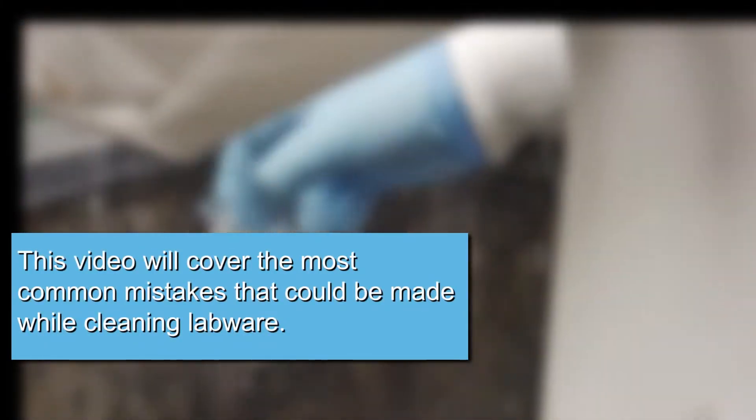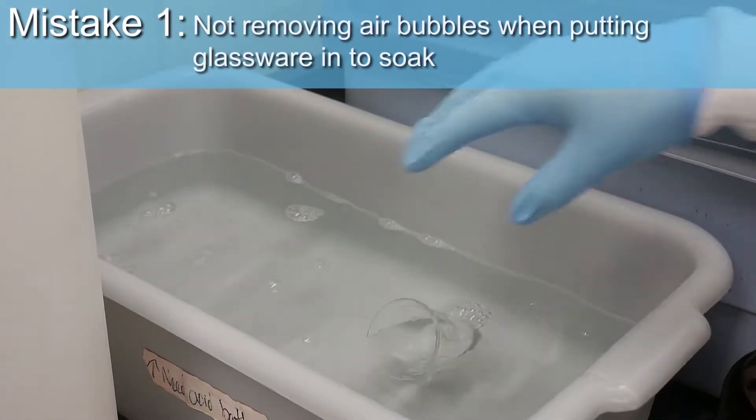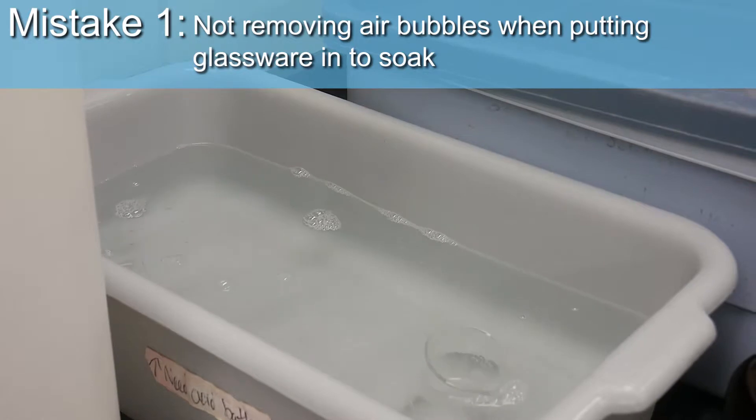This video will cover the most common mistakes that could be made while cleaning labware. Mistake 1: not removing air bubbles when putting glassware in to soak.